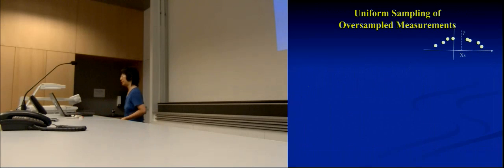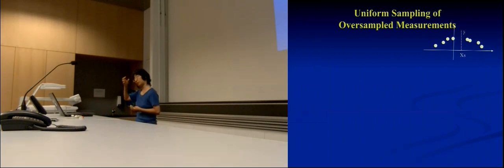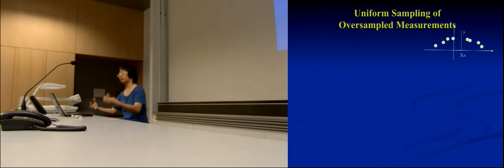Okay, the whole idea of doing a lattice line fitting is no different from what you do in a polynomial fitting of any data that you get normally. So I'm hoping that you learned somewhere about the fitting. You may not know exactly how it works, but you know what you need to think about.